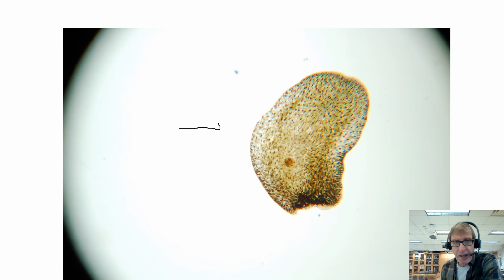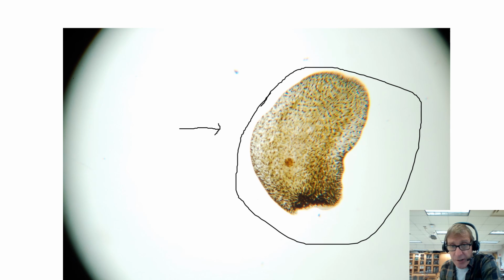This one, I'm also going to put it in phylum Platyhelminthes, and the class is Turbellaria, free-living flatworm. Now, some people have now split this off into a different group. I believe they split the phylum. But this is a small marine flatworm. You can't see much in there. All these little dots you see all over the body wall here, those are symbiotic algae. These are commensals, I think, on some soft corals. This is a small marine species. These are like half a centimeter, a third of a centimeter long, so they're not very large, but they have symbiotic algae in them. It is a platyhelminth, a flatworm.